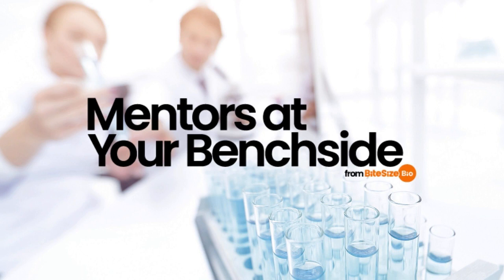The more samples you take for a given attribute, the more precise the representation of your measurement. In situations where sampling is destructive or you can't take multiple measurements, for example growth rates in a culture, you can increase the number of replicates to compensate. However, for measurements like OD readings or cell counting, it's reasonably easy to measure multiple parts of a single sample.